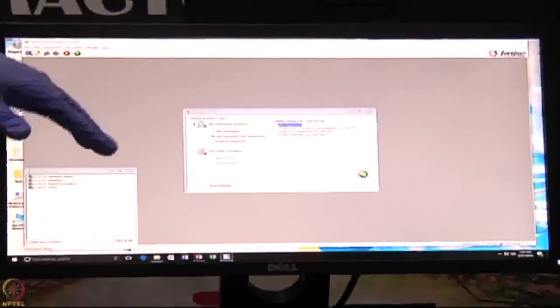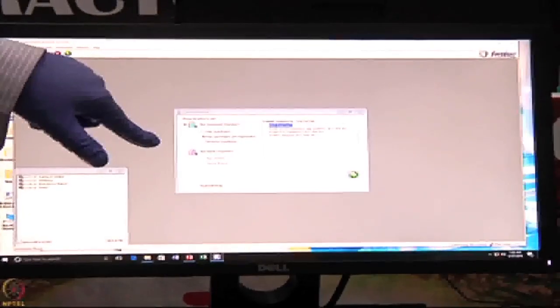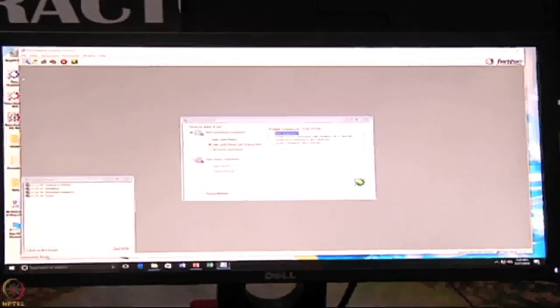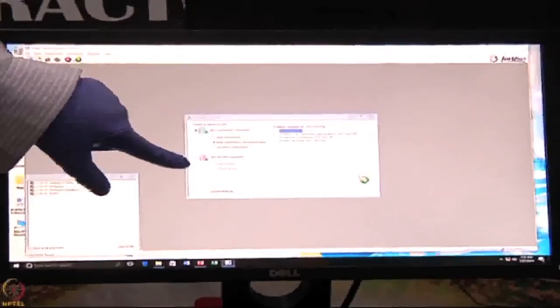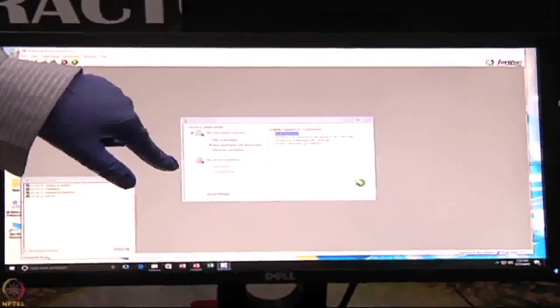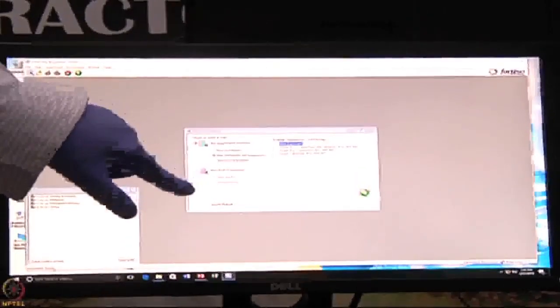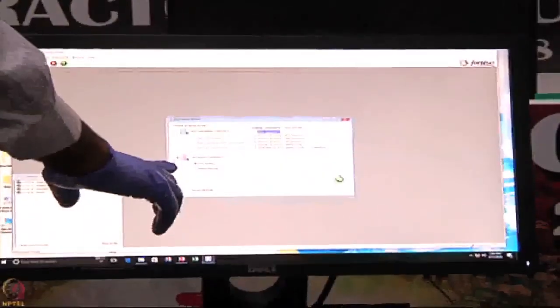When you click on the data acquisition software, you can see there is a wizard asking what kind of experiment you want to do, a kinetic study or a quantitation study. Our interest is kinetics experiments. We can do epitope binning also, but there is one more software for that. So I will check kinetics experiments, then click this green mark to say go.